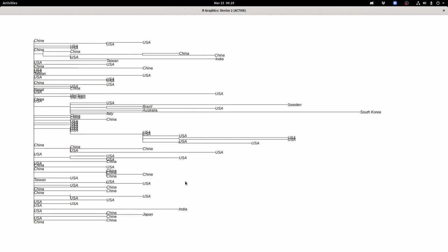The vertical distance doesn't matter, only the horizontal distance does. And things back here at the base all match the reference sequence from China. And so this is not really enough data to understand the outbreak fully, but it is interesting with the public sequences that we have available to see certain patterns. And it's kind of interesting.